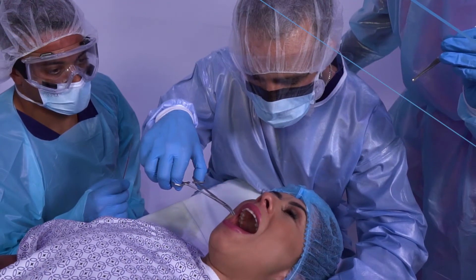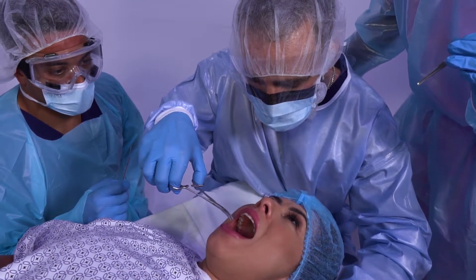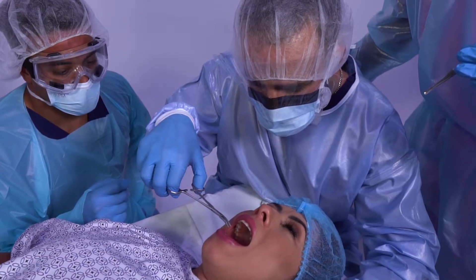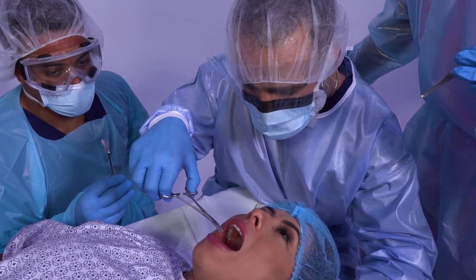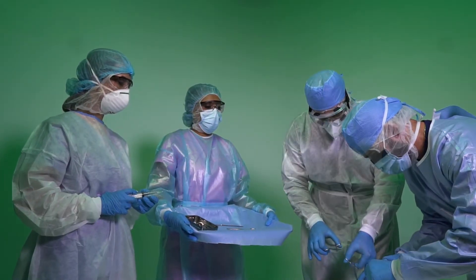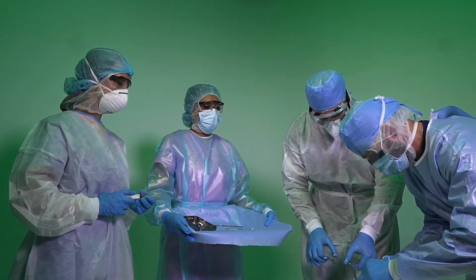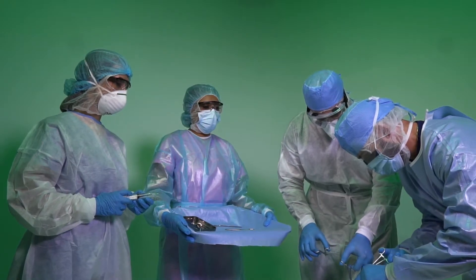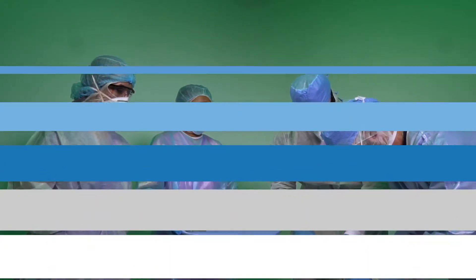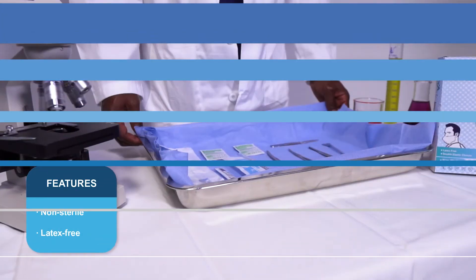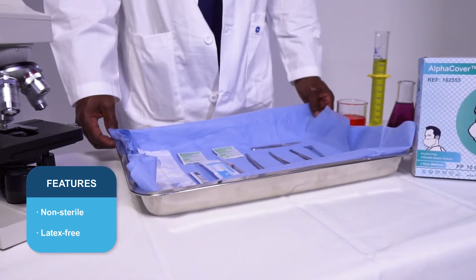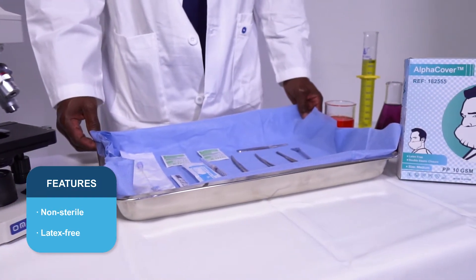This item can be layered above or under with other respiratory, ocular, or headwear PPE products offered by Alpha ProMed for a complete infection control strategy. All beard covers are non-sterile and latex-free.